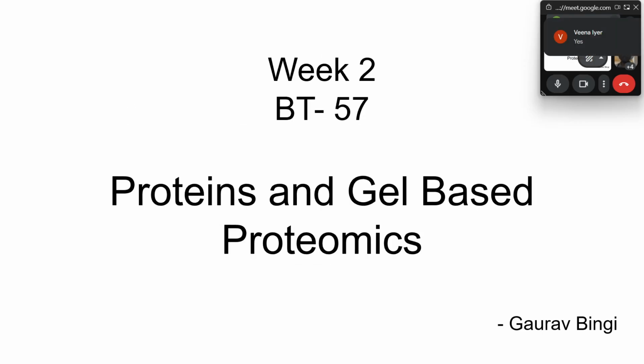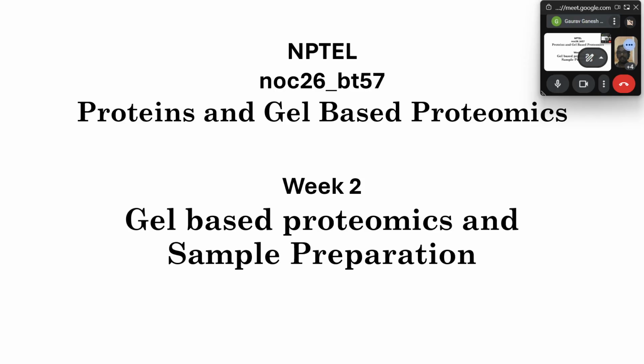Okay, thank you. So, welcome to week two of the NPTEL course, which is Proteins and Gel-Based Proteomics. This NPTEL course has the code BT57. In this week two, we'll be majorly dealing with gel-based proteomics and sample preparation for gel-based proteomics.